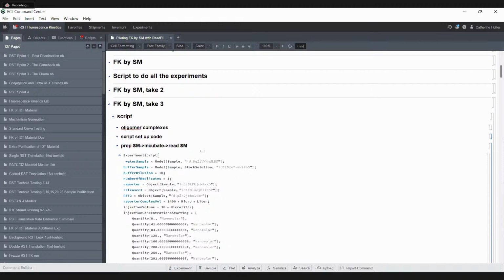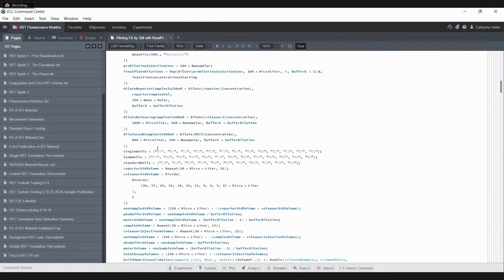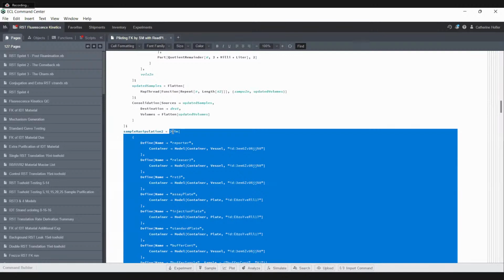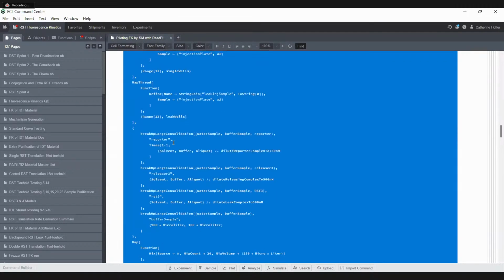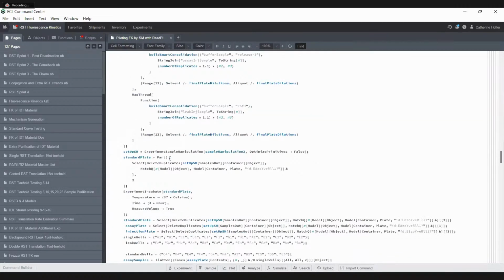Can you scroll down a bit and let's see? Oh, yes. So here's a bunch of setup stuff. Math to do some dilutions, explicitly specifying which wells samples are going to go into. And if we scroll down a little bit further, here's my sample manipulation call itself, or the operations that are going to happen. So defining some samples, and let's scroll down to the actual transfers down here. It's not an uncomplicated experiment. It's a very complicated thing.